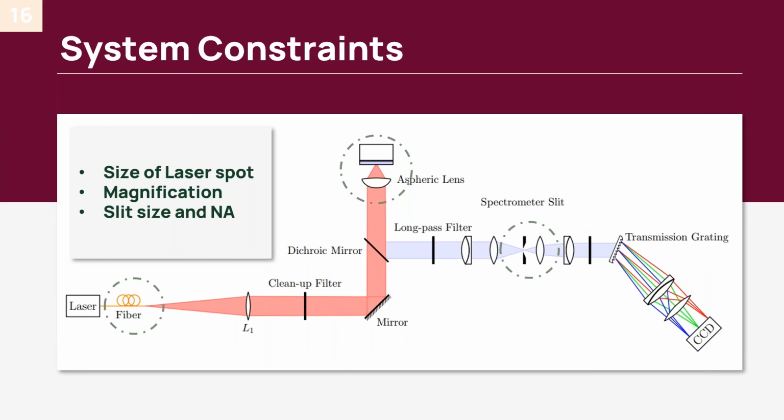Typically, you have a laser that you want to use, and it can come in many different configurations, but it wouldn't be unusual for them to have like a 50 or 100 micron fiber. And that's with a 0.22 NA output. You could, of course, use a similar input for the sample. You end up with a spot size that's again 100 micron, 0.22 NA. But what if you wanted to have a larger numerical aperture?